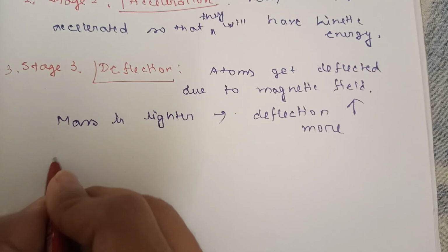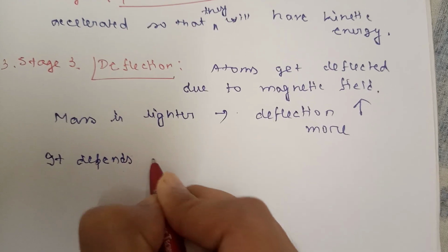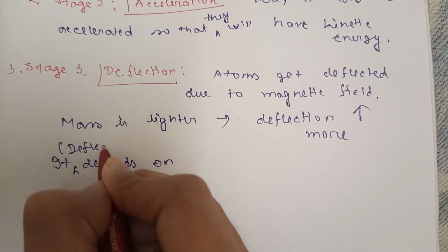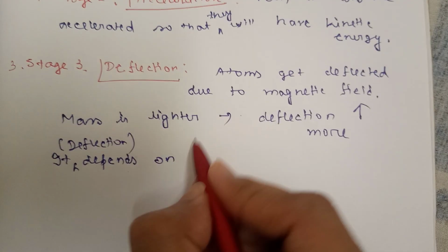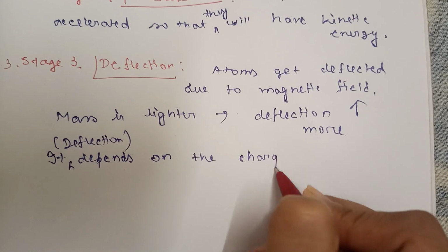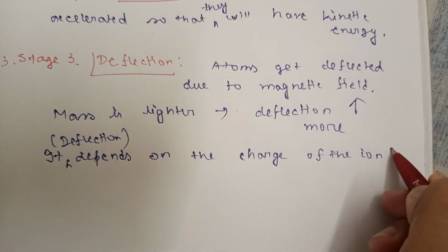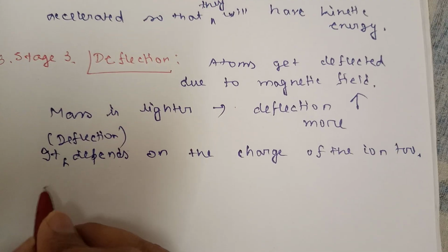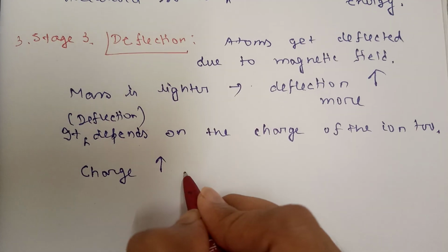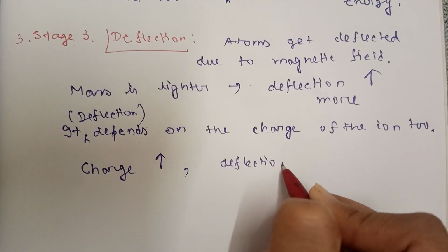Also, deflection depends on the charge of the ion too. Charge more means deflection more.